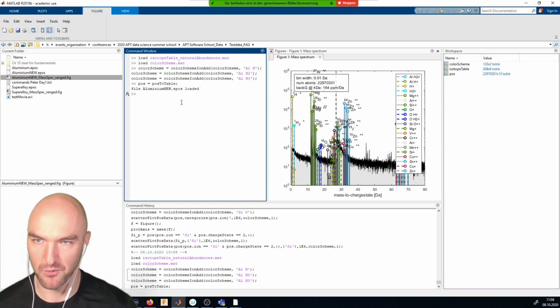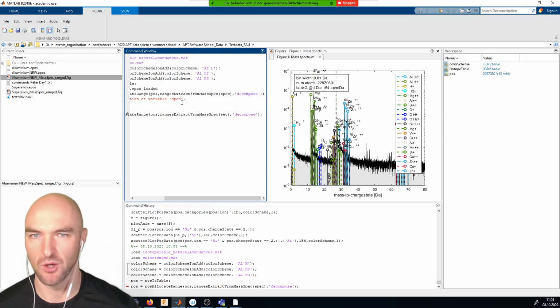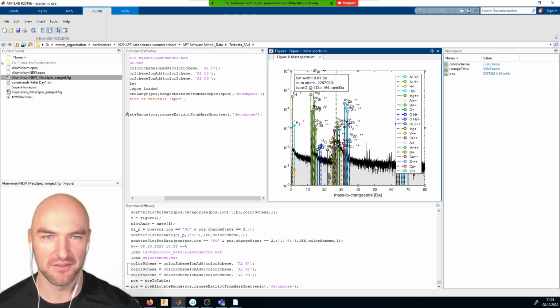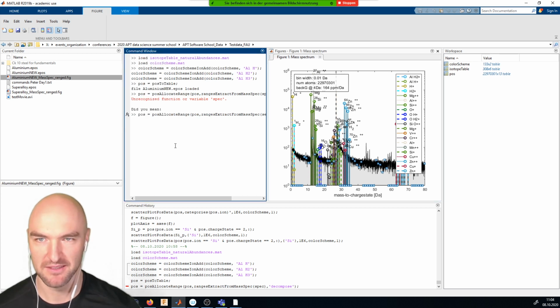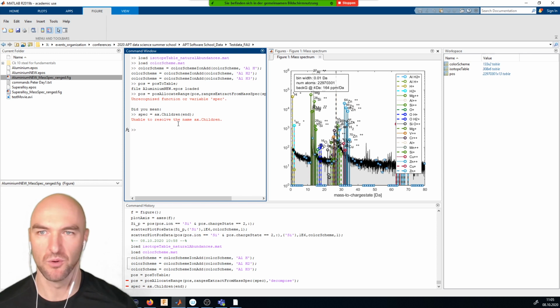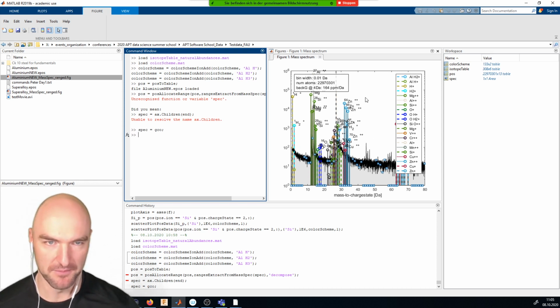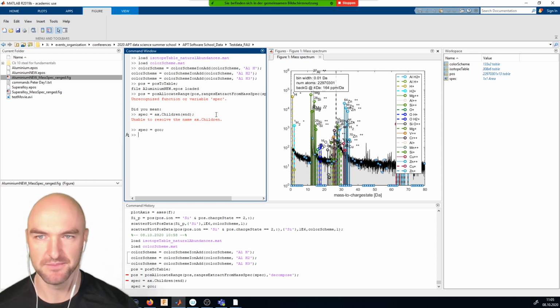And obviously we'll go and allocate the ranges, and we'll work based on elements right now. Of course, I have to go and select the mass spectrum and load it in. Obviously, this would also work. Oh, no. Because I haven't gotten the axis, but yeah. Now we've got the spectrum again.